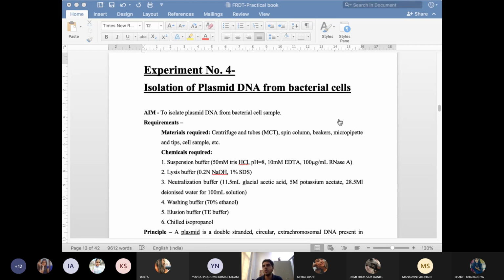So how are we going to utilize it? We are going to utilize it in the method that we call the alkaline lysis method. What are we going to do in that one? In that one, the simple thing we are going to utilize is the term alkaline. So what do you mean by alkaline? What do you mean by alkaline?